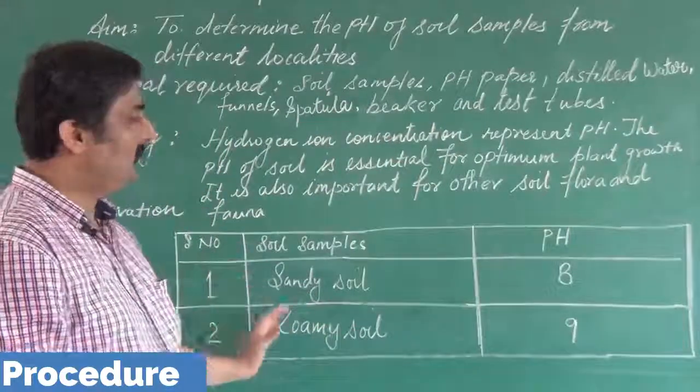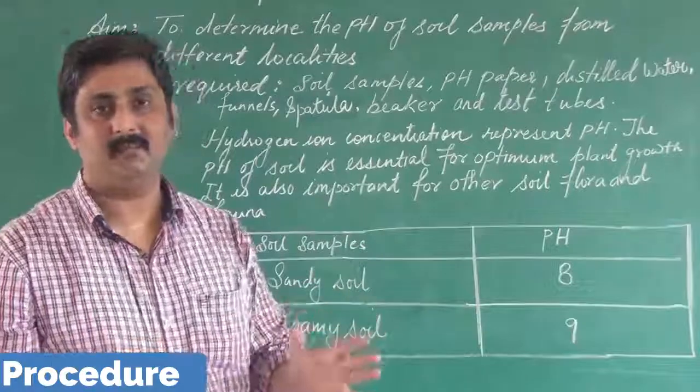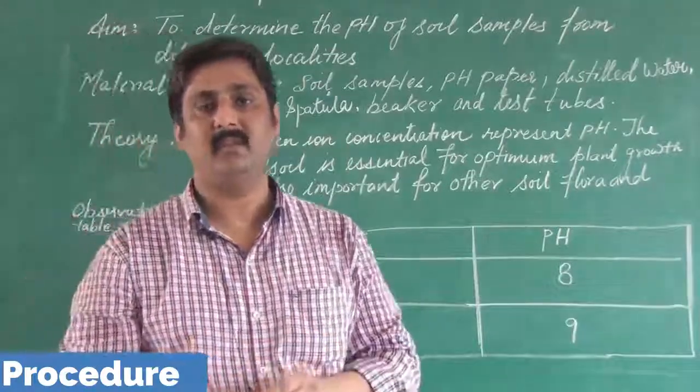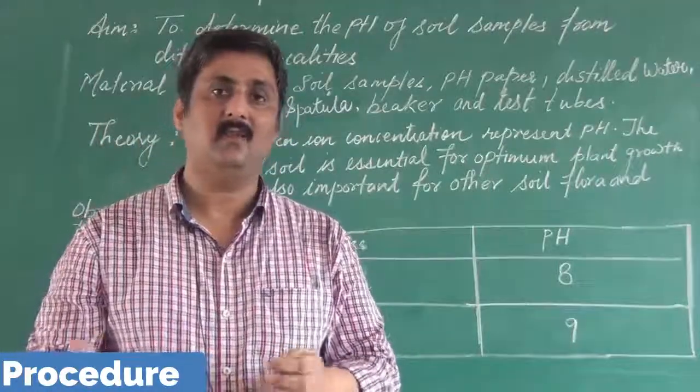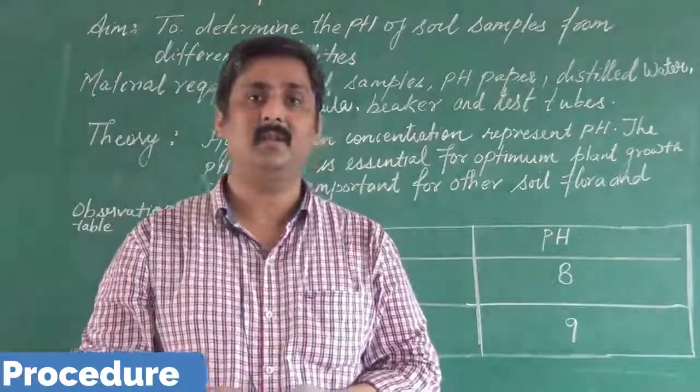So you need to be careful regarding preparation of the solution and measuring of the pH. That is the only precaution. This was one of the simplest experiments on soil.